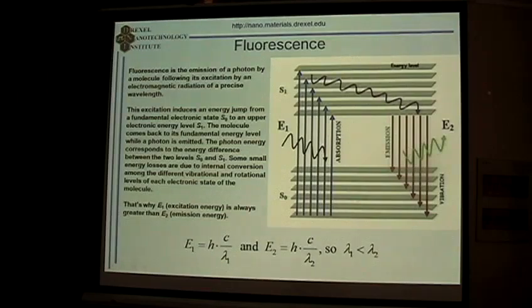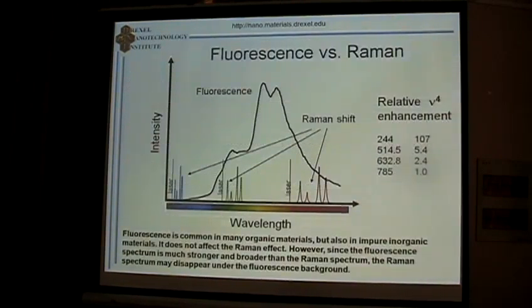If you use fluorescence spectroscopy, this is what you want to have, and this is what you want to use, particularly by comparing excitation and emission spectra, as I showed in the first slide, because there will always be some changes in energy due to losses in the transition. And I apologize, I have a blue and violet light again.